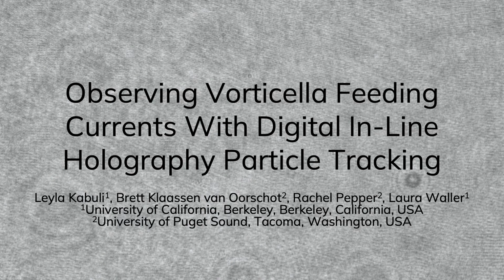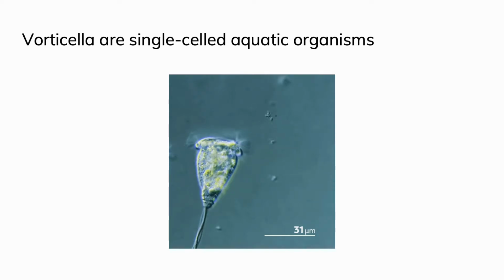This work is titled Observing Vorticella Feeding Currents with Digital Inline Holography Particle Tracking. Vorticella are microscopic organisms that clean toxins. They form a critical part of aquatic ecosystems. Our goal is to understand their 3D feeding currents.